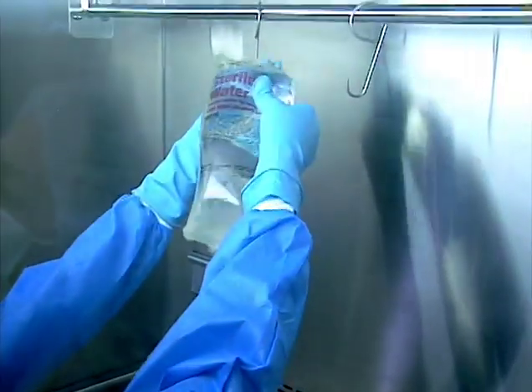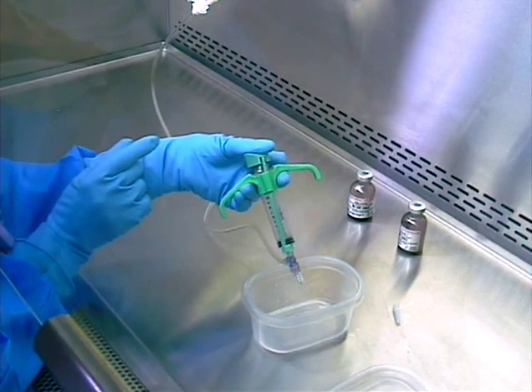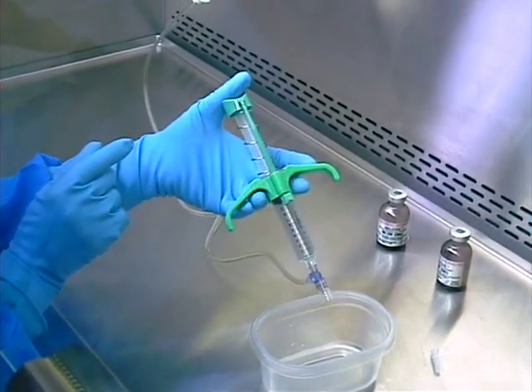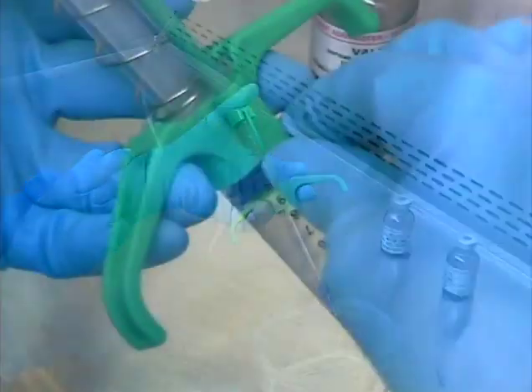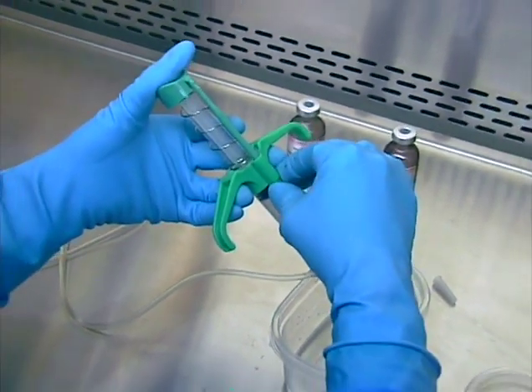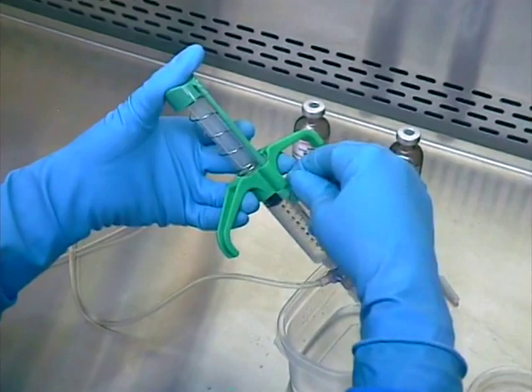To prime the tubing and fill the syringe, depress the plunger completely and let it retract, holding the needle over a specimen cup or other container. Repeat this action until the tubing and syringe are completely filled, and adjust the syringe to the desired dispensing volume by depressing the plunger the appropriate amount and turning the retaining nut down the threaded shaft to lock the plunger in place.